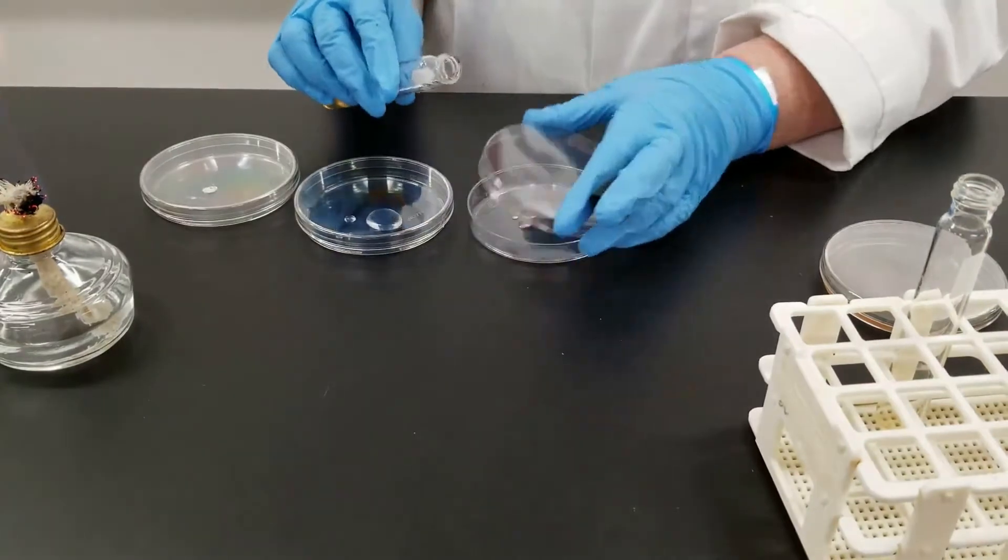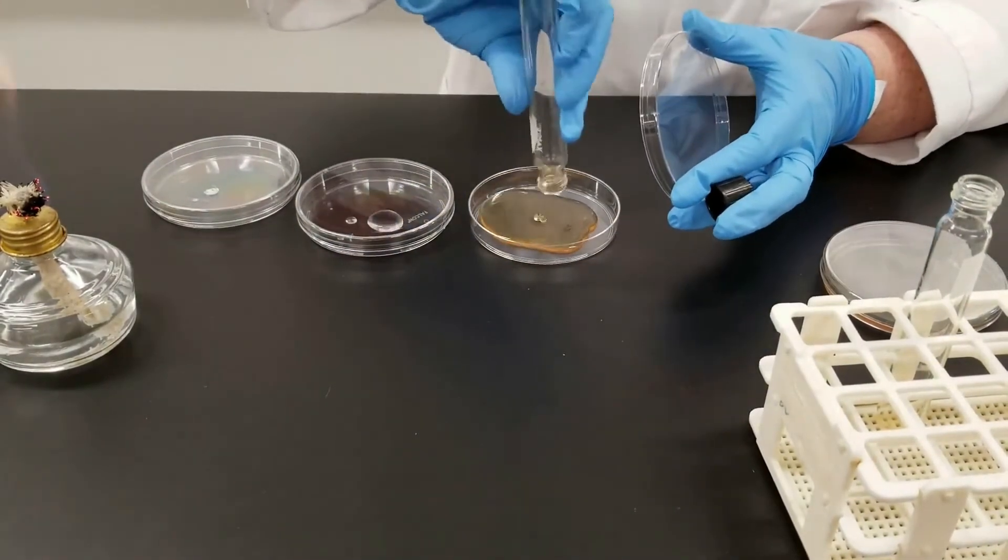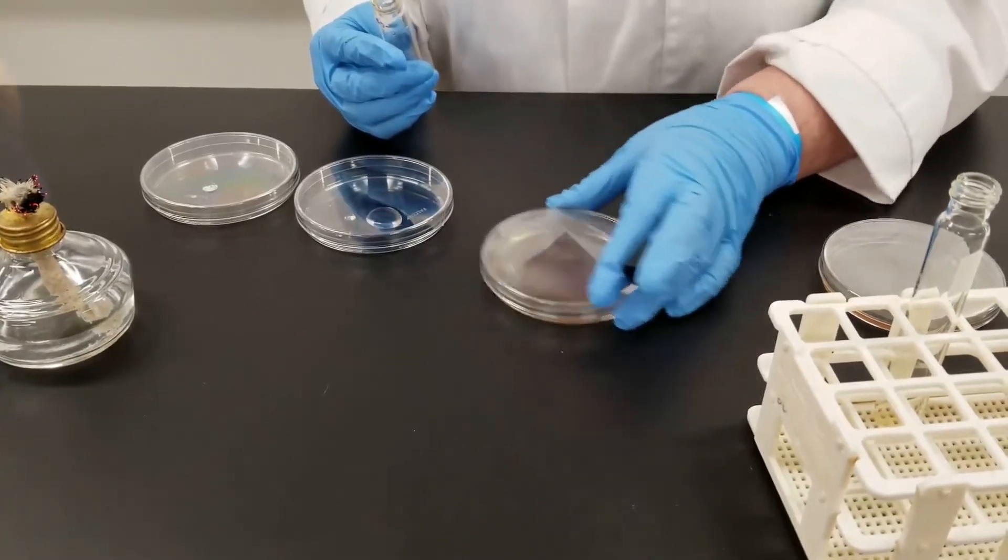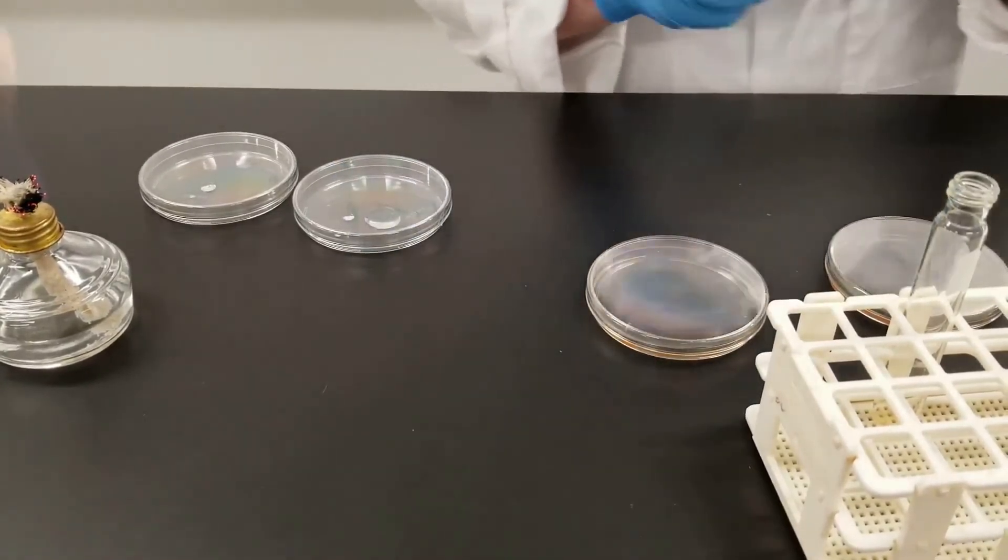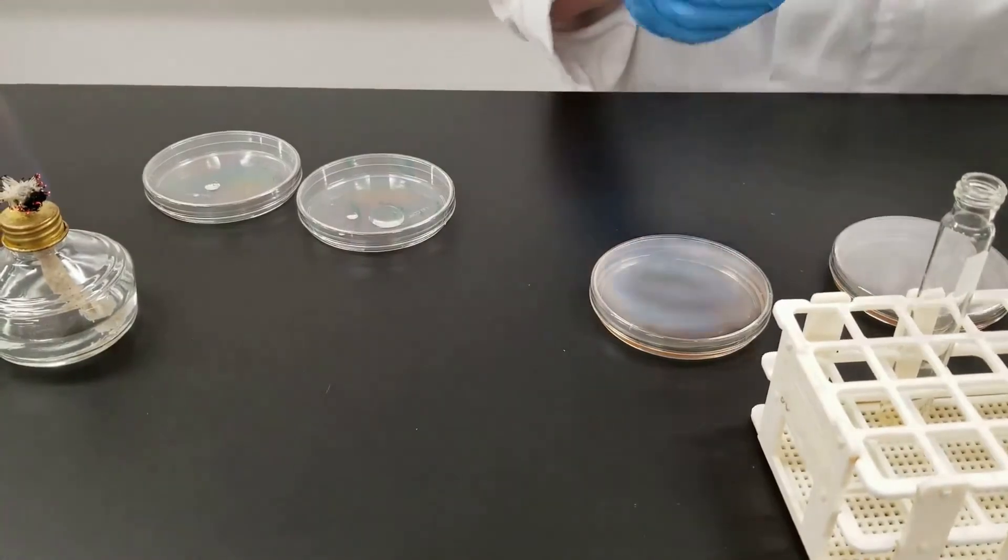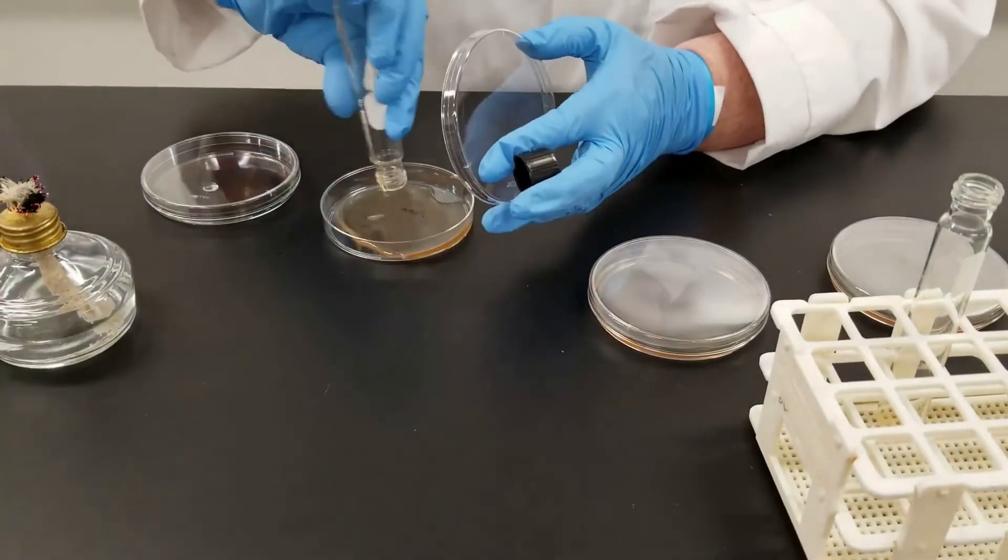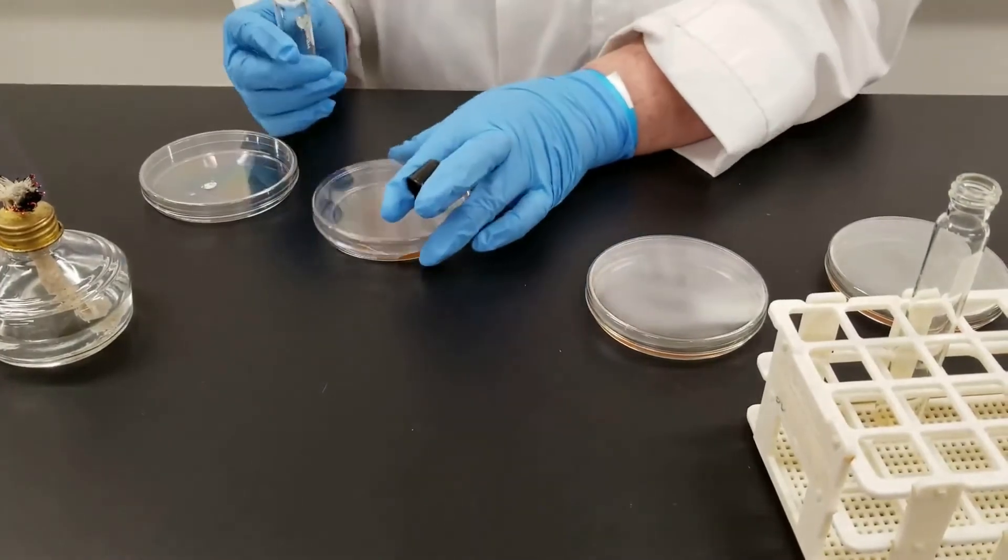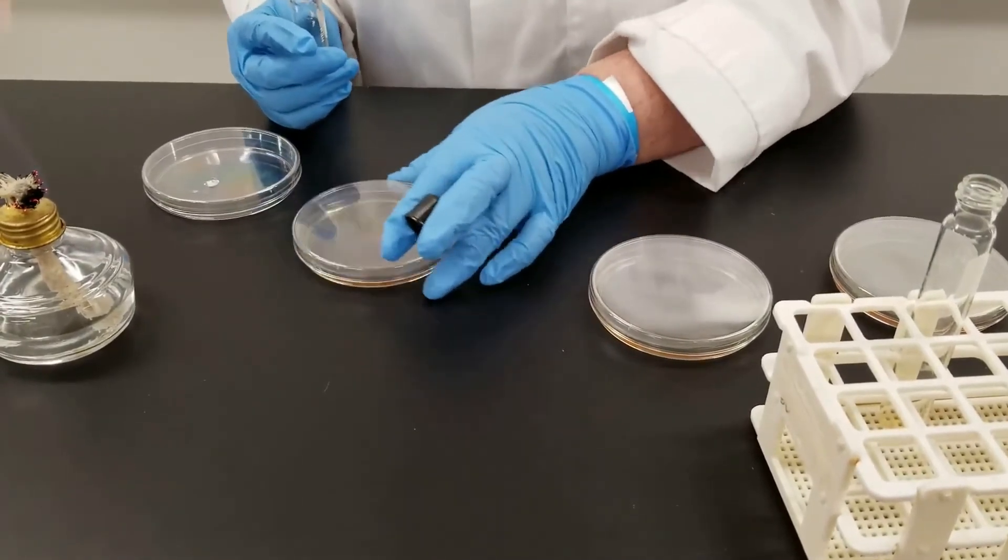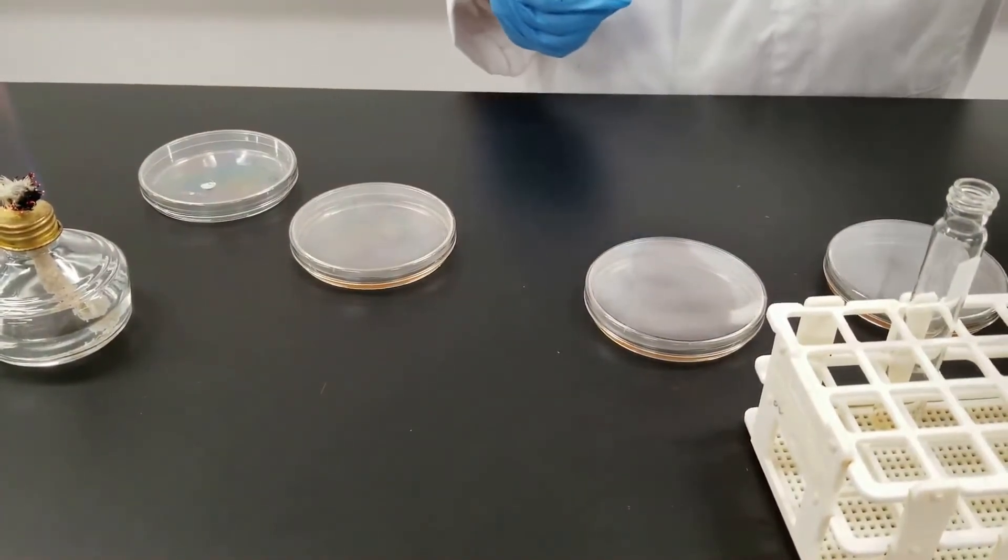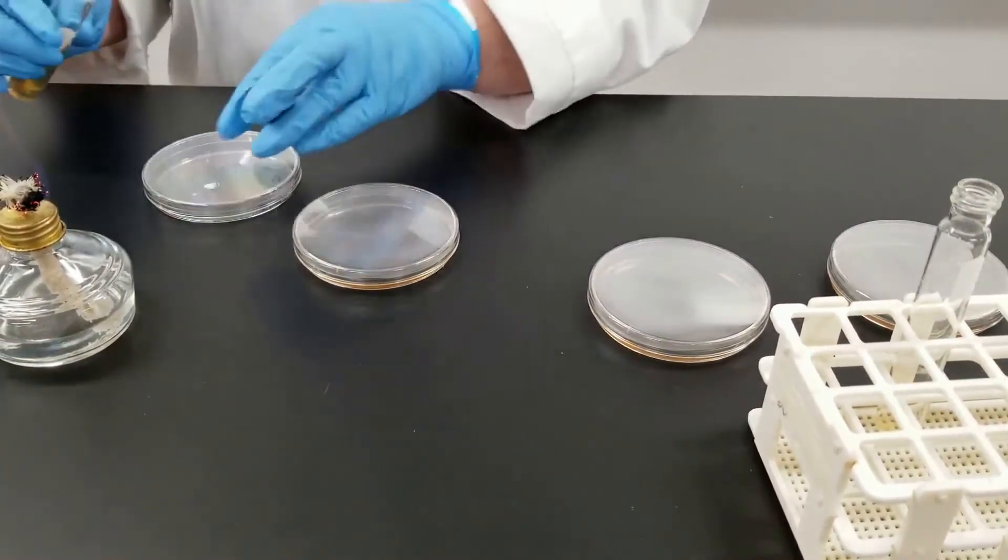And then we're just going to go down the row and do that for each one of these plates. Remember to swirl it so it evenly covers the bottom of the plate. Plus that also helps to mix up the sample well. With pour plates, remember, different than a streak plate, you could have bacteria growing throughout the medium, not just on top, but throughout.